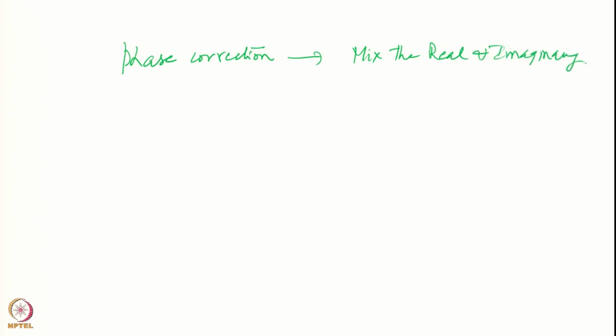So therefore phase correction would imply mixing the real and imaginary parts appropriately to eliminate the admixture.